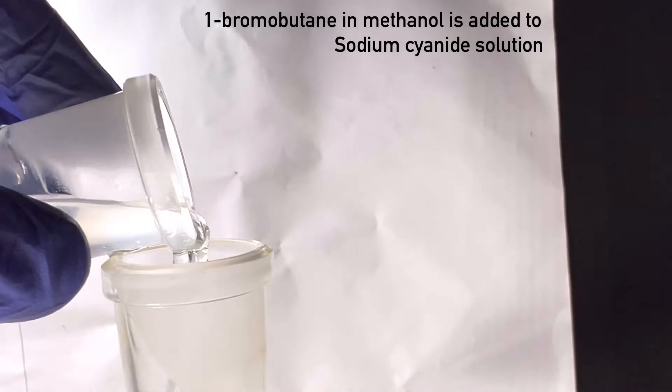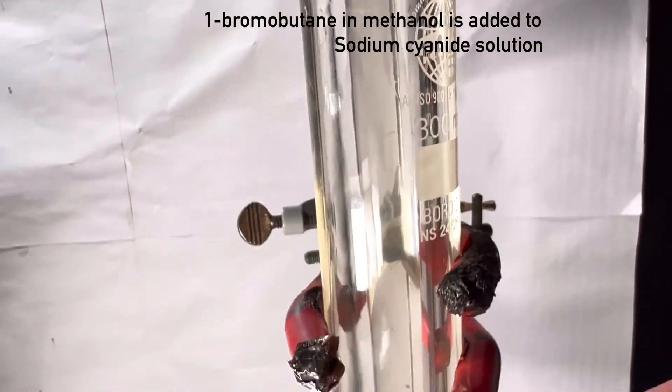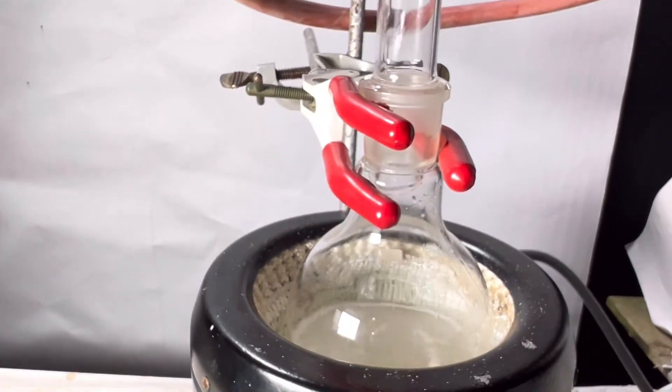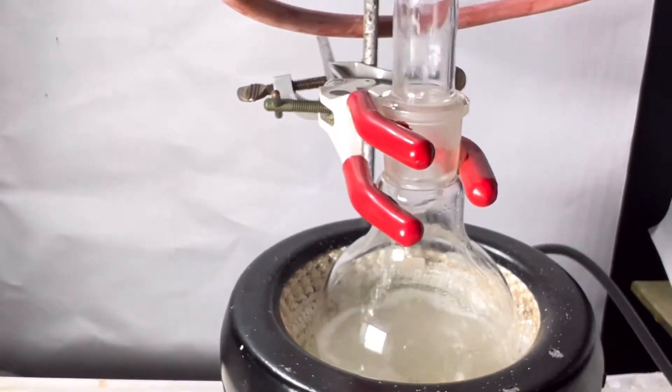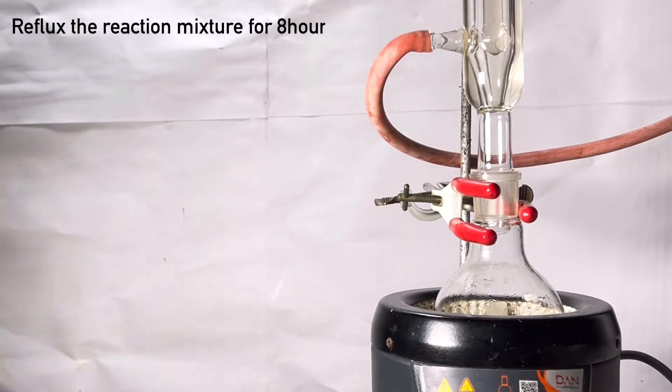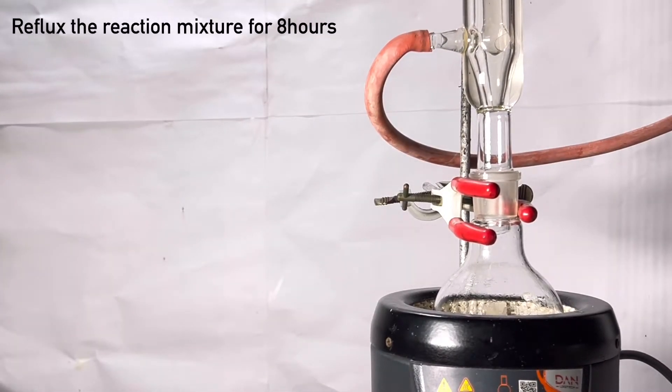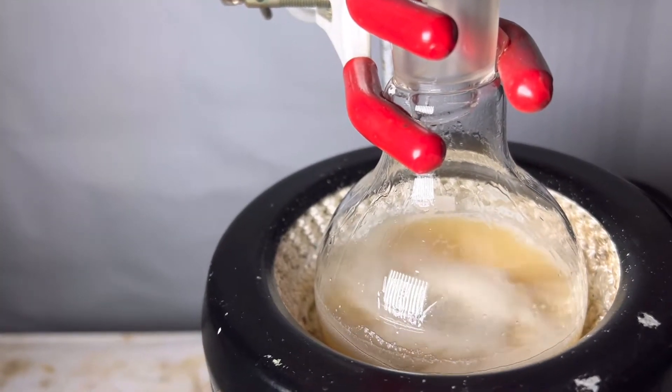Now the 1-bromobutane in methanol solution is added to the round bottom flask through the top of the condenser. Now the flask is heated gently. Soon a gentle reflux commences and the reflux was continued for another 8 hours.